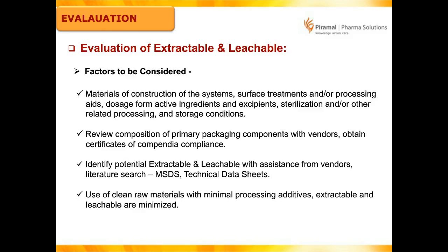So if you have a rubber stopper from that particular vendor, we need to do the extractable study again with our drug product. Many companies don't understand why the extractable study needs to be repeated if the vendor is providing the information in the certificate of analysis. Just to update, the extractable study is for your drug product, not for the rubber stopper.